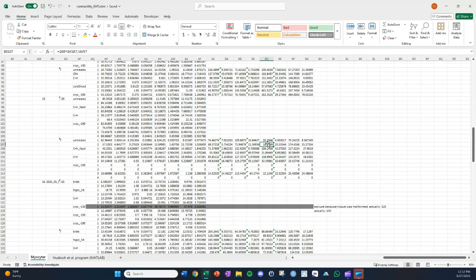One of the things I've noticed is that if you keep the plate at room temperature, then the contraction relaxation speeds do go down over time. So definitely try to keep it at 37 degrees Celsius. The method we have could be improved for doing that. Right now, these videos were collected just using a conduction plate on top of the well plate lid. And so I think in the future, if there's some way to capture all these videos in a more controlled environment at 37 degrees Celsius, that's good.